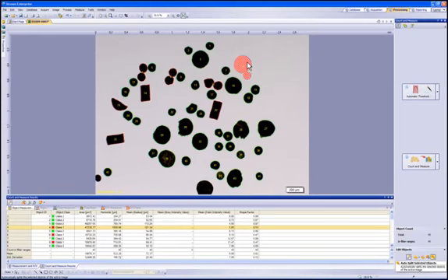We now need to decide to either manually split the particle by drawing a border line between them by hand, or to select the auto split option within the software. Let's try the auto split option since the particle can be easily determined as two particles based on its shape. The particle has now been split into two separate particles and the object measurement list was updated.